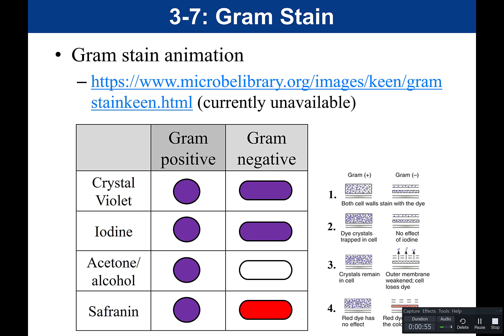When doing gram stains, use young, actively dividing cultures. If cultures are old, the cells may become gram-variable, meaning the age of the culture affects cell wall structure, producing abnormal staining results. So it's critical to use young, actively dividing cultures.